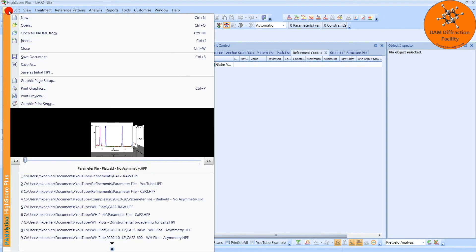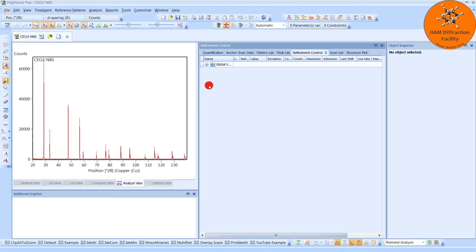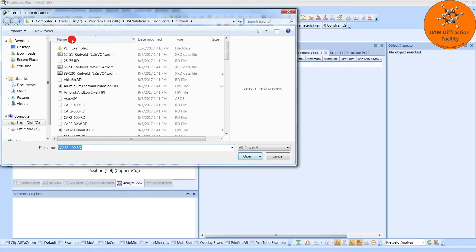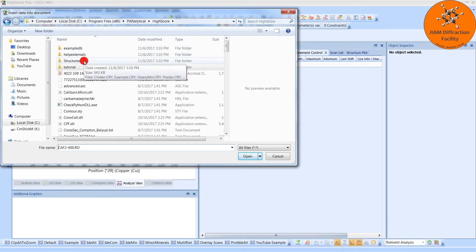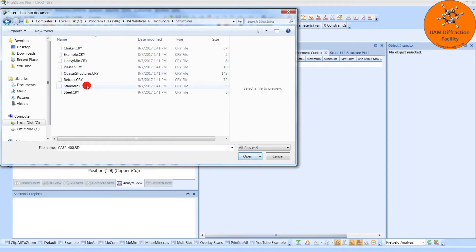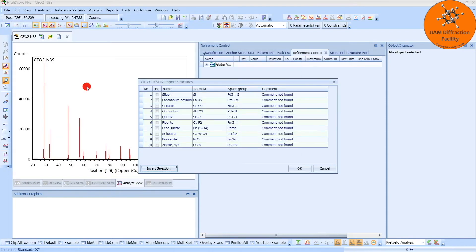But for this example, we can go to File, Insert, or we can do Insert here. If we go back a folder to HighScore, and then click Structures, we have this standard.cry. Double-click that, and we see a list of phases.